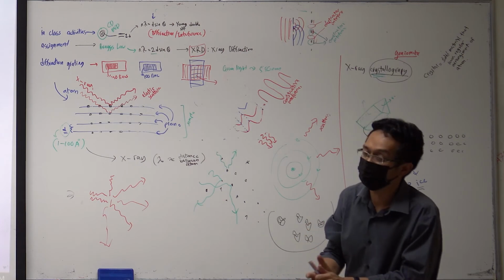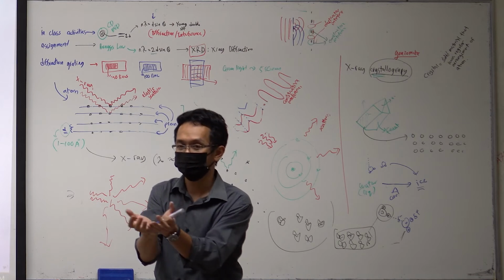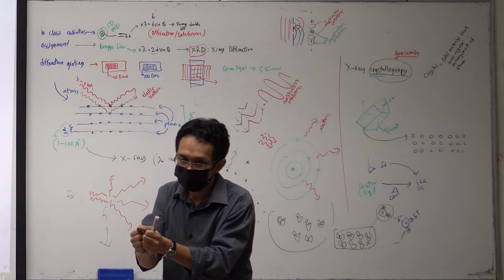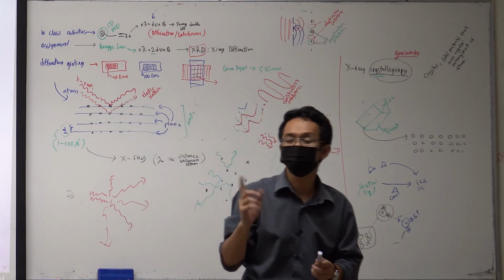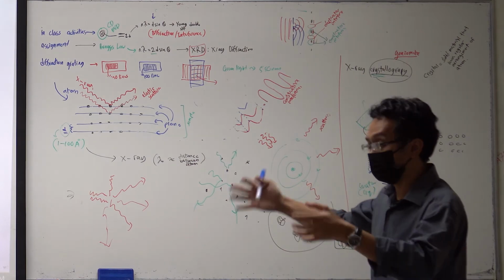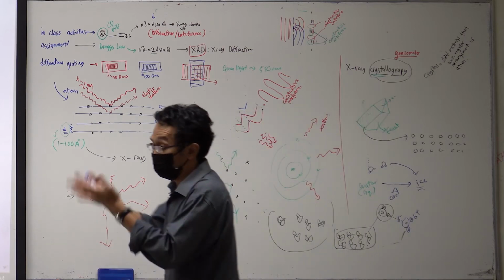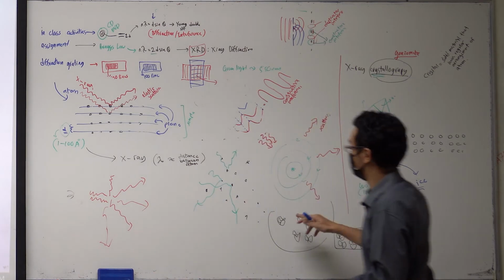You cannot just simply evaporate the water, because if you have blood and you want to see the structure of blood, and you just evaporate the water, then it will shrink. There are methods for that. Typically they use cryopreservation, but we don't deal with that. Just to tell you that you need a lot of things, and then something will evaporate, and after evaporation, you get a structure like a crystal. You get a crystal.